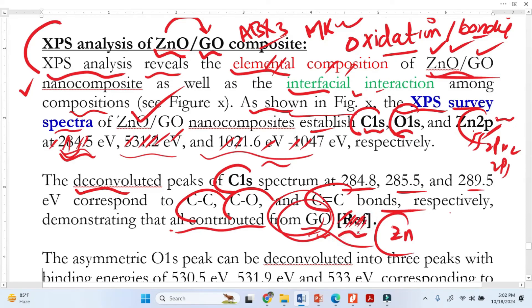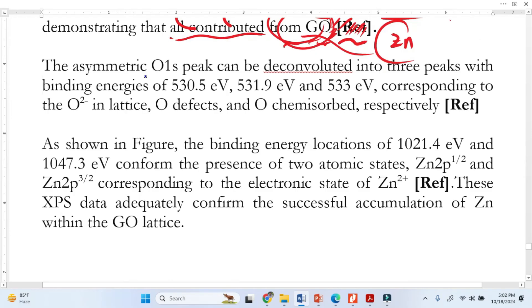Another important thing: you must add a reference here, because a reference is very important — it strengthens your claim that your result matches the literature.